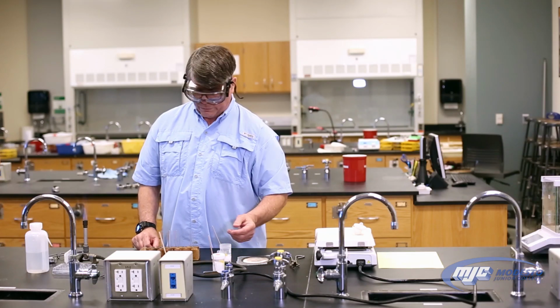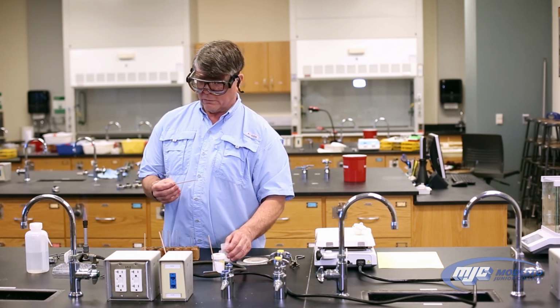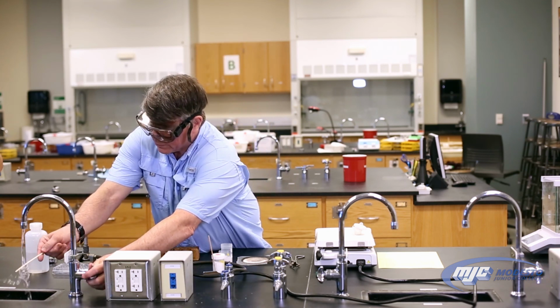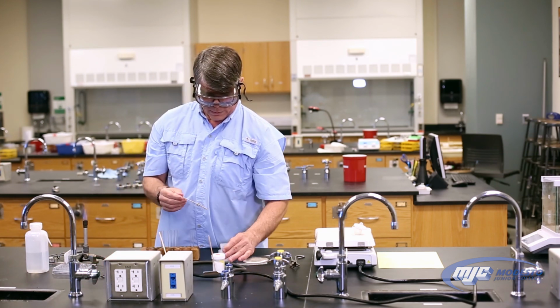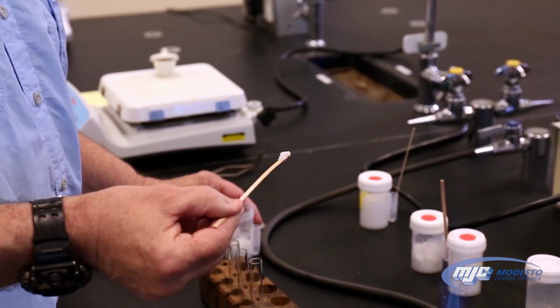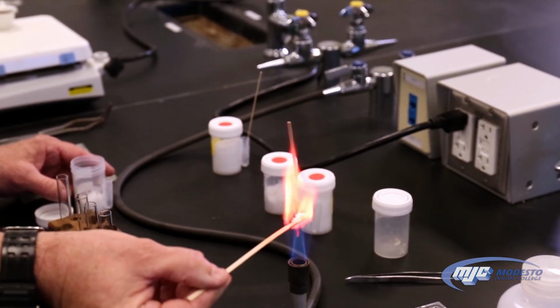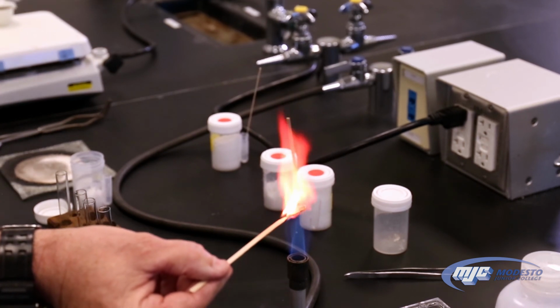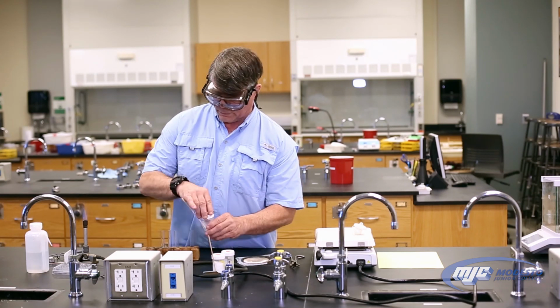All right, so now that we've got our Bunsen burner set, we can do the flame test. What we're going to do is use a wood splint. It's just a coffee stirrer. Get it wet, and that helps the hydrate to stick to it a little better. Get some of your unknown on the tip and stick it in the flame. So that red right there tells us that we have strontium atoms in there, which means that our anhydrous salt is strontium chloride. Next one.